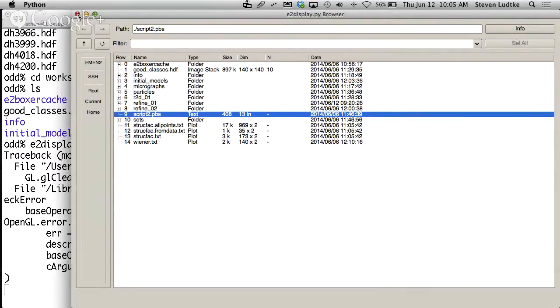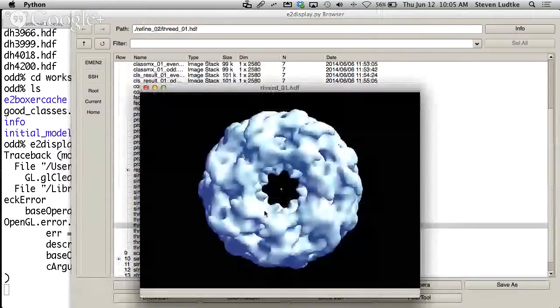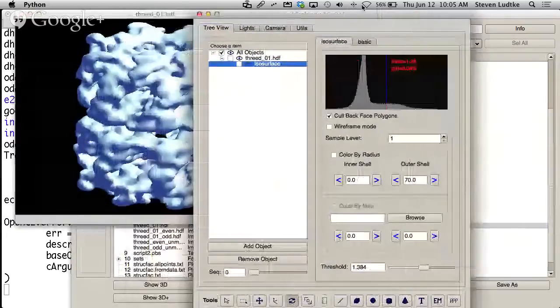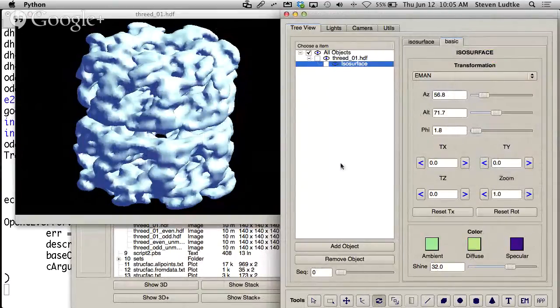Oh, one last thing I forgot to do when we were looking at 3D volumes. Let me just get back to that really quick. So let's say we have a 3D volume. I showed you how to scroll through multiple volumes and annotate them a little bit, and strangely not change the color. I wonder if the color will work right if I'm just displaying one of them. Huh. Looks like recently somehow the color must have just broken completely. All right, let's forget the color again for now.